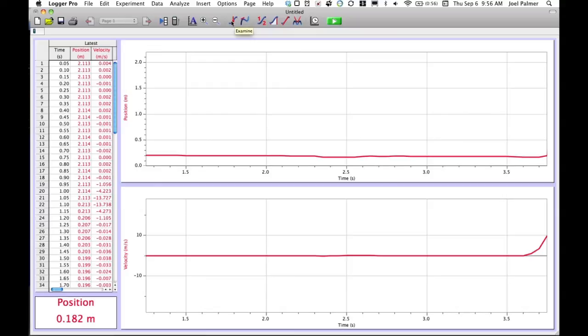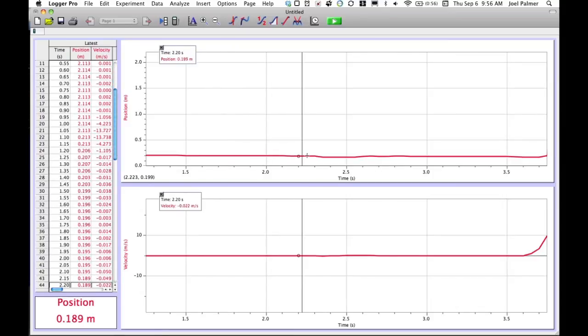The first one is called the inspector. It allows you to scroll along your data and get a readout of exactly what the data was at that point. The inspector is a tool you might want to use if you're wanting to get specific data values off a graph. The others you're free to play with, but they're probably not going to help you very much.